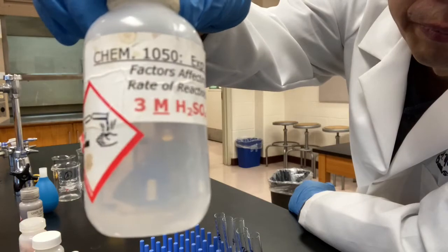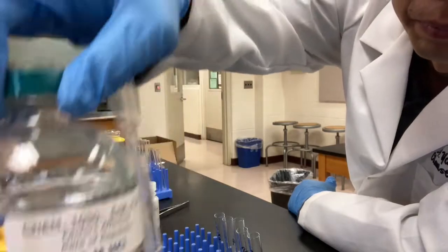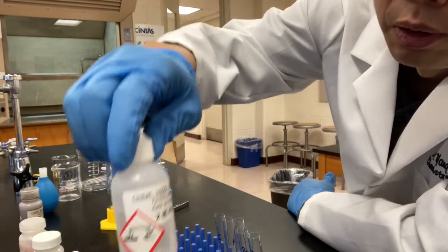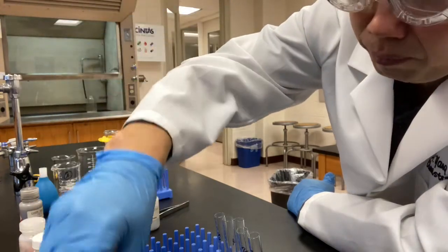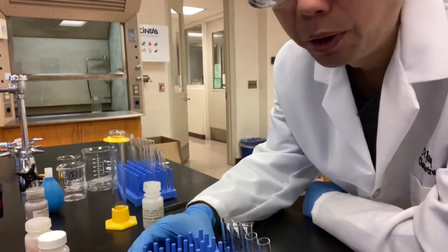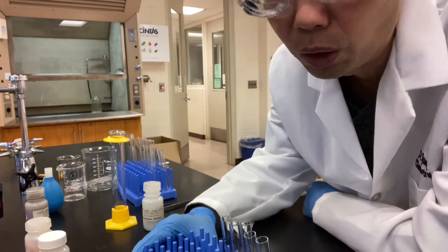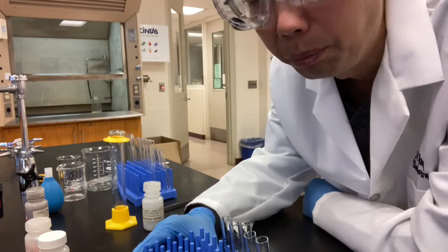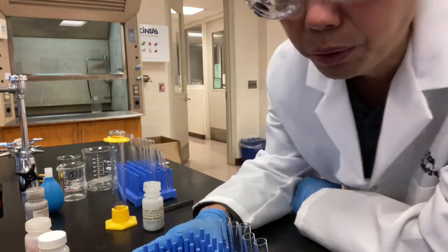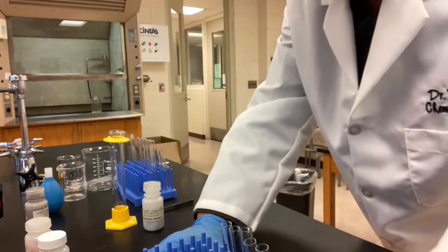We have sulfuric acid, hydrochloric acid, nitric acid, phosphoric acid, and acetic acid. Whenever you have to operate on acids, bases, or other corrosive chemicals in the lab, make sure you wear gloves.